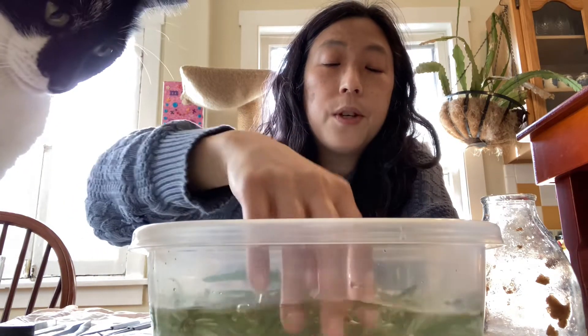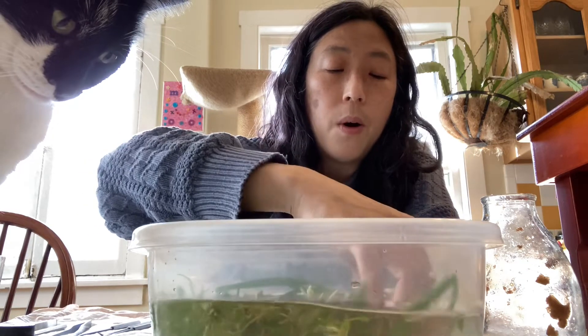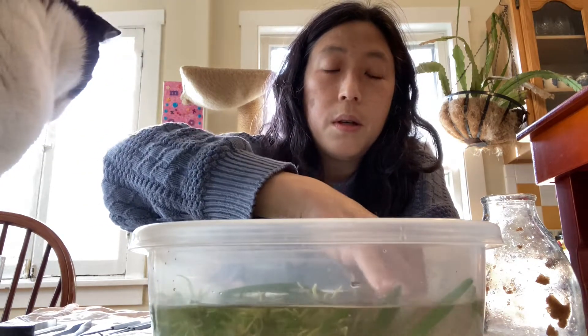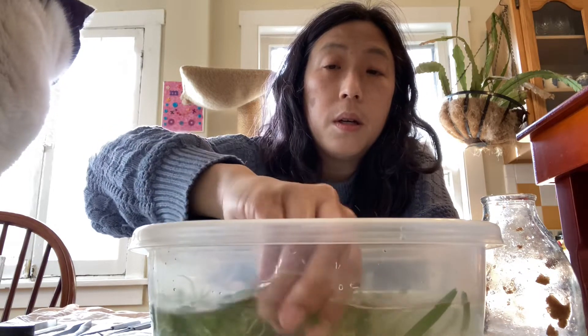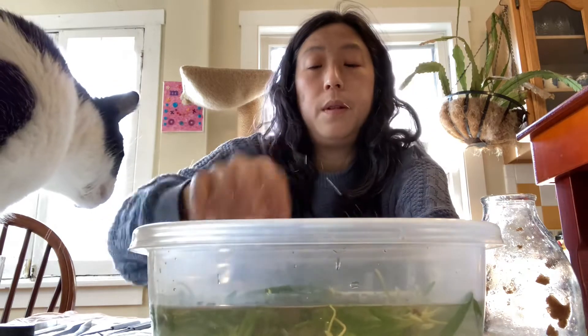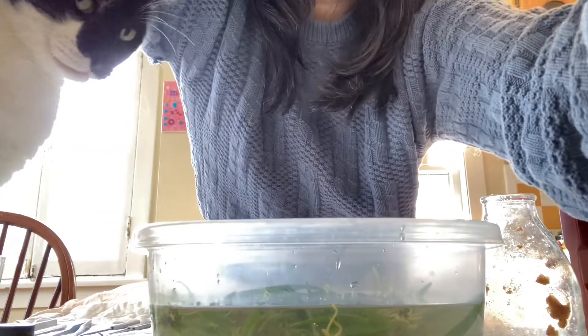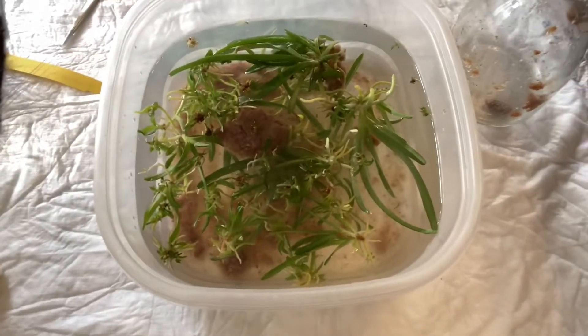So now we have — I wonder if I should make a second little container of water to put these in after I wash them. Let's have a little overhead shot. This is what the jar container looks like.